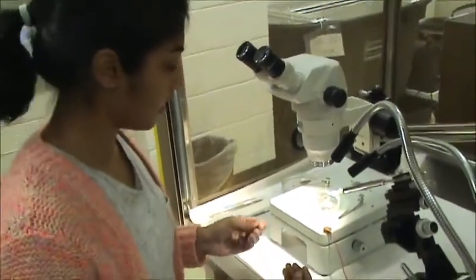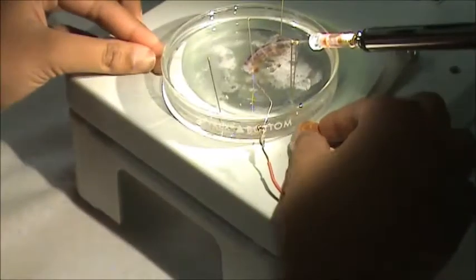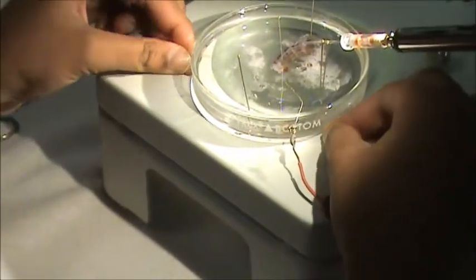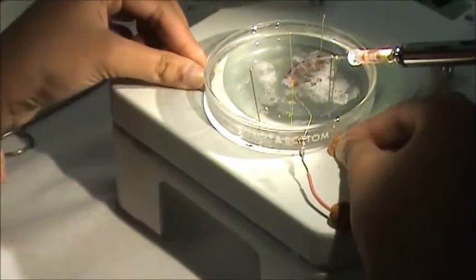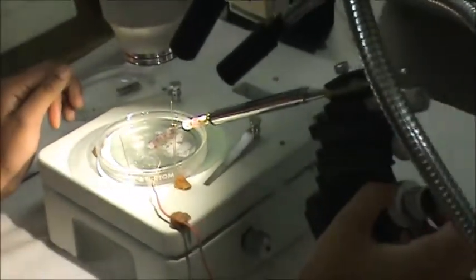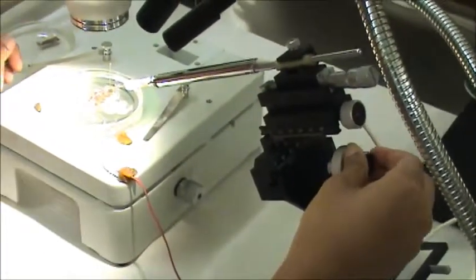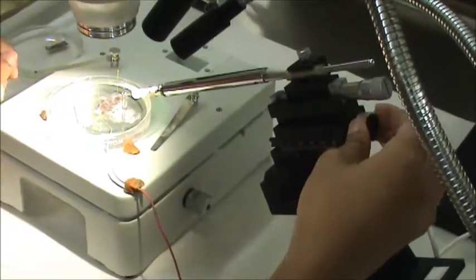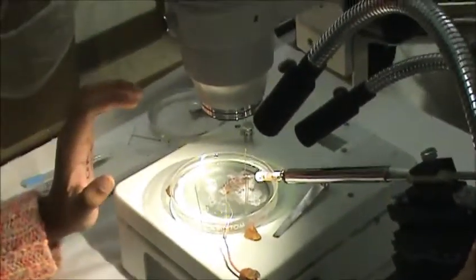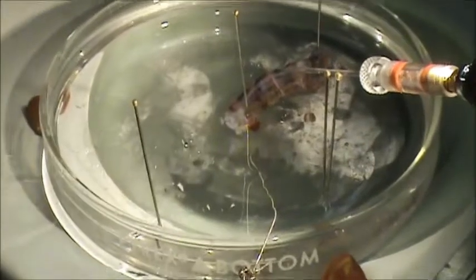So what you're going to first want to do is put this clay, wax, whichever one, next to your dish so it won't move around when you're poking it with your electrode. And you can use the coarse knobs here to move your electrode around gently. And so you can figure out how to get the tip of your electrode right over the muscle that you want to stab.